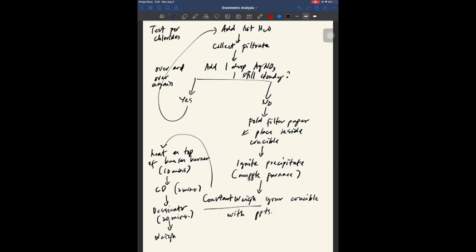So basically, this one is the schematic diagram for your experiment. It takes a very long time to perform gravimetric analysis. But after determining the mass of your precipitate, you can finally calculate the percentage of sulfur in your unknown sulfate salt.